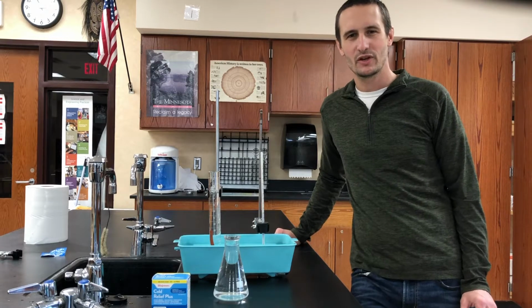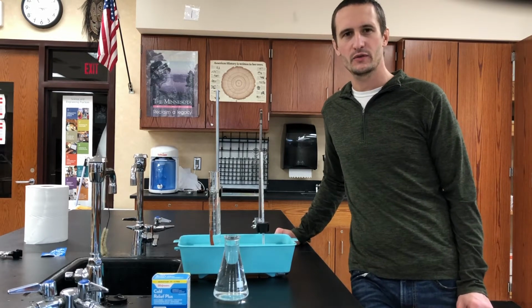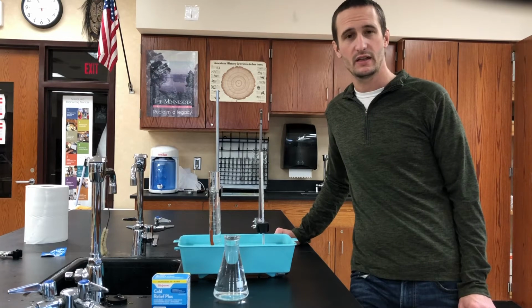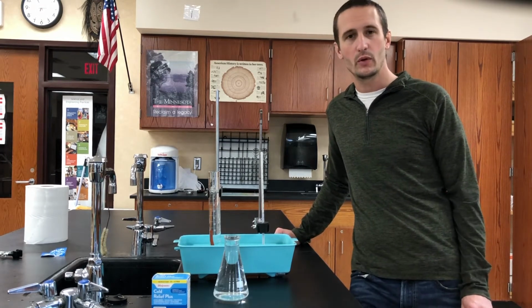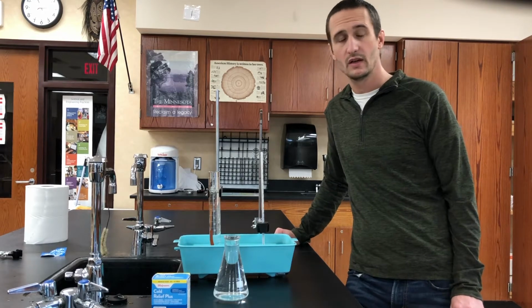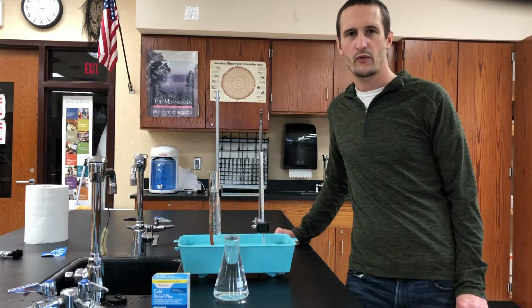Hey everybody, Mr. Johnston here, and we are going to take a look at a gas collecting technique that involves bubbling the gas through water in order to figure out what the volume of gas that's collected is. We're going to be using water displacement in order to figure out the volume of gas collected. And from there, we can figure out the number of moles of gas collected using a couple of concepts that we've learned: ideal gas law for one and partial pressure of gases for another.